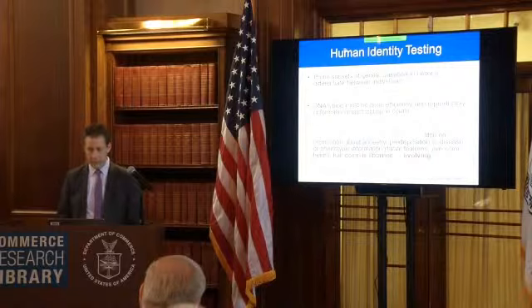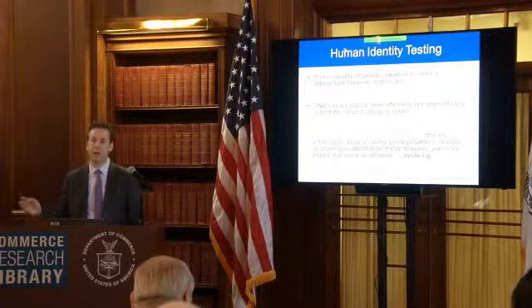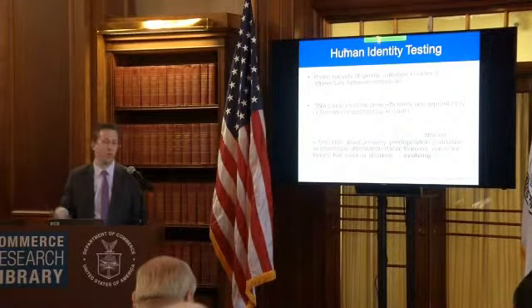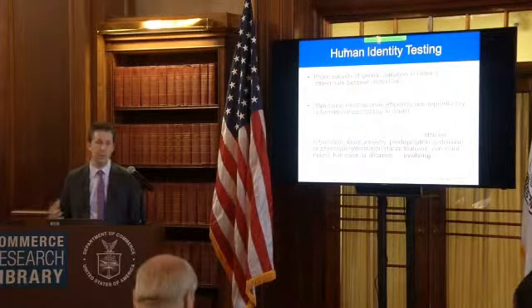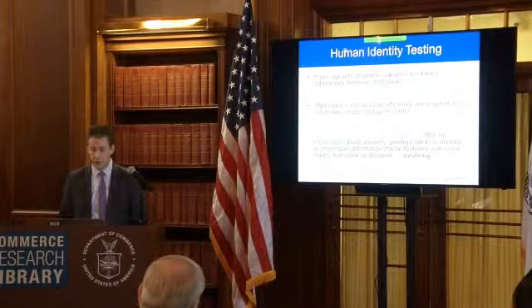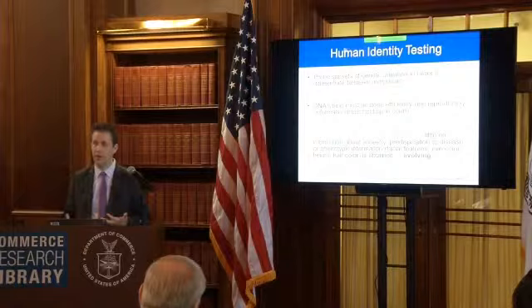Also, this is changing, but really we're not looking at genes. The regions that we're targeting lie outside of genes, so you don't have any ethical issues with knowing something about a disease state from an identity test. There's really not much information about ancestry, eye color, hair color, or facial features in the standard test that we'll be talking about. But this is evolving over time.